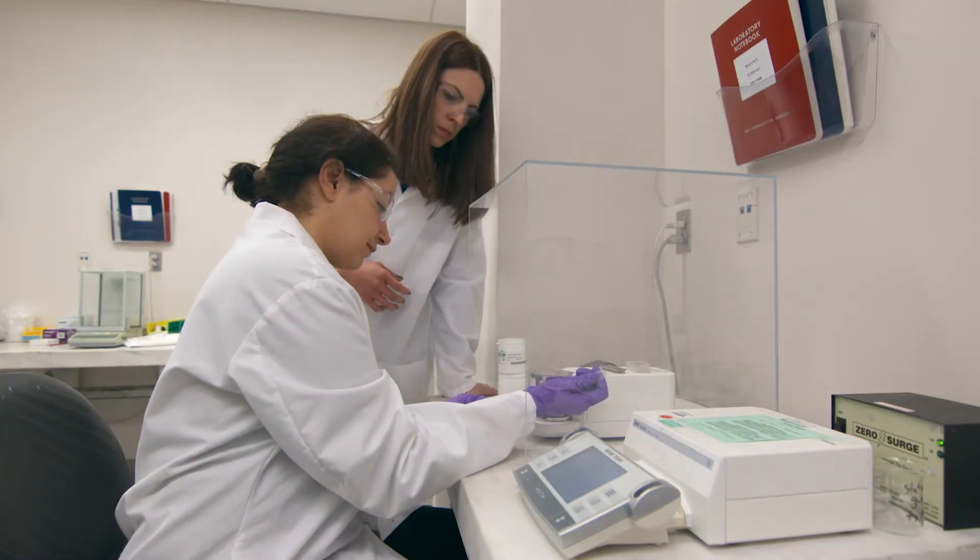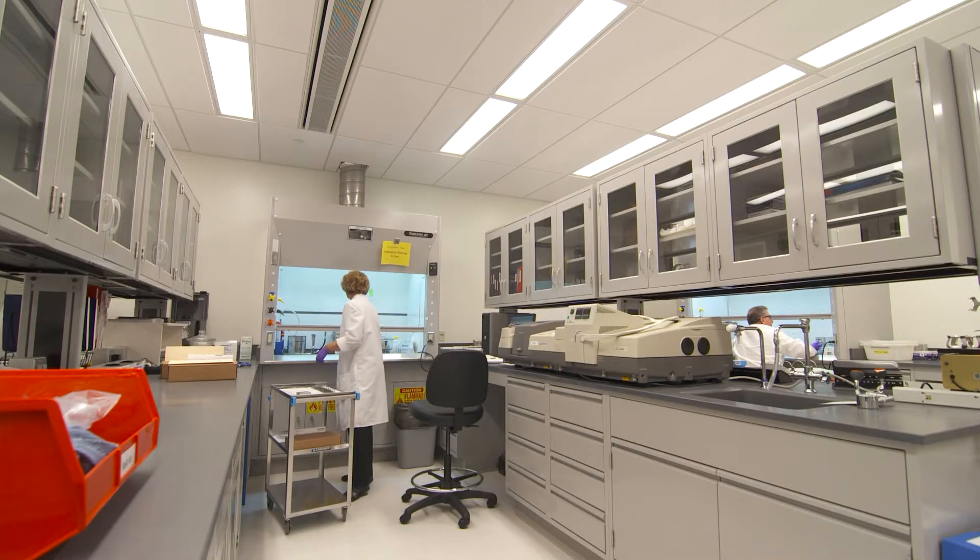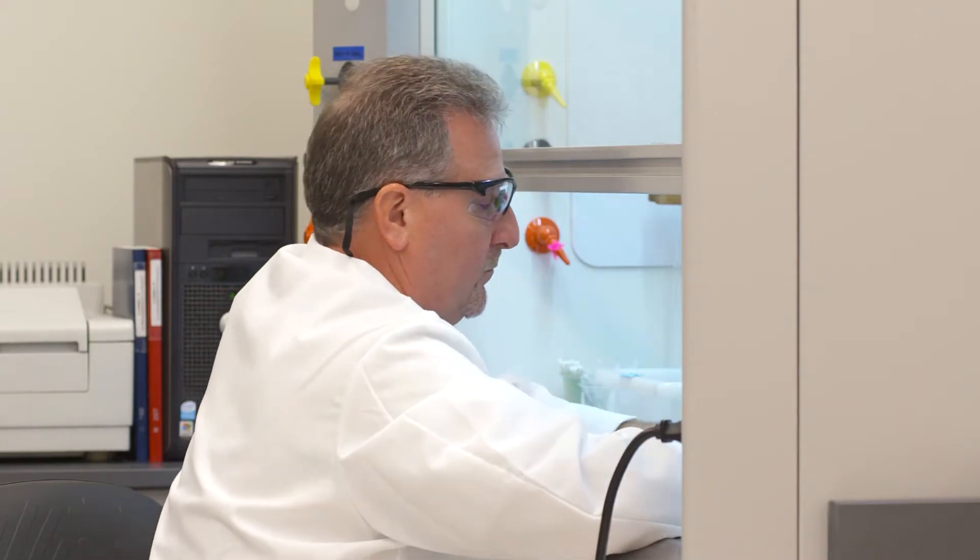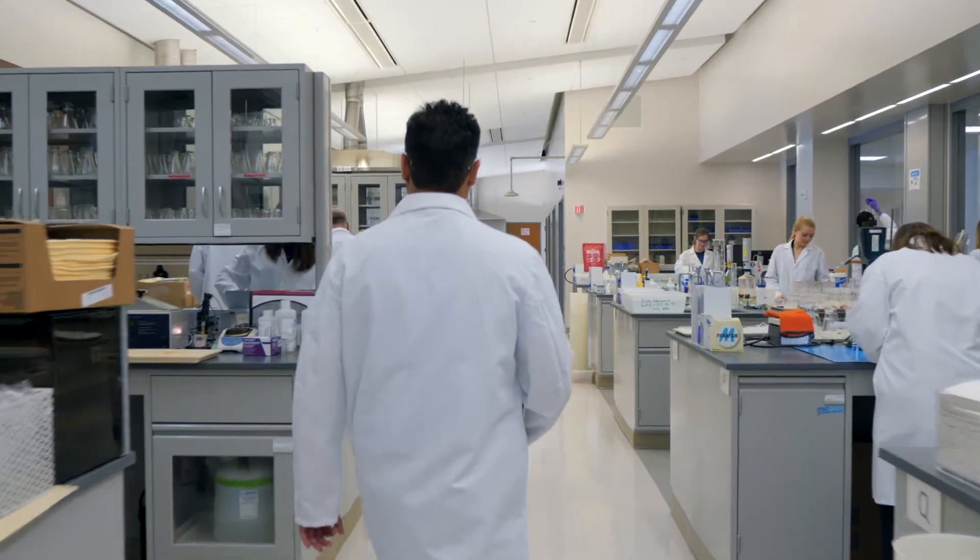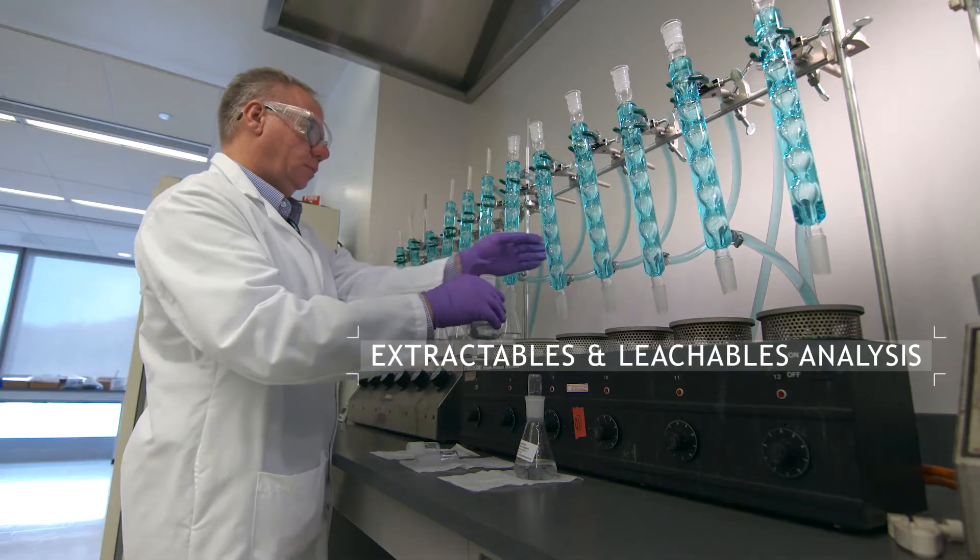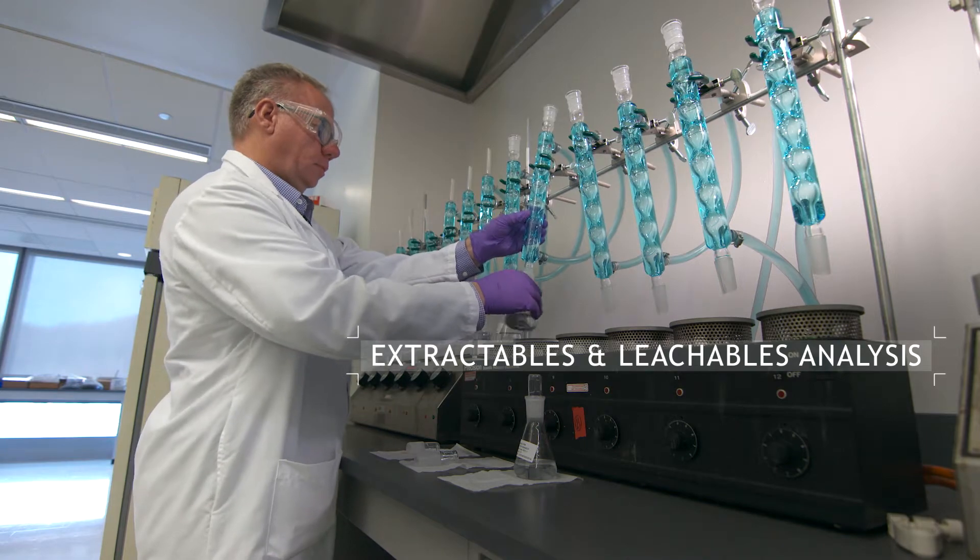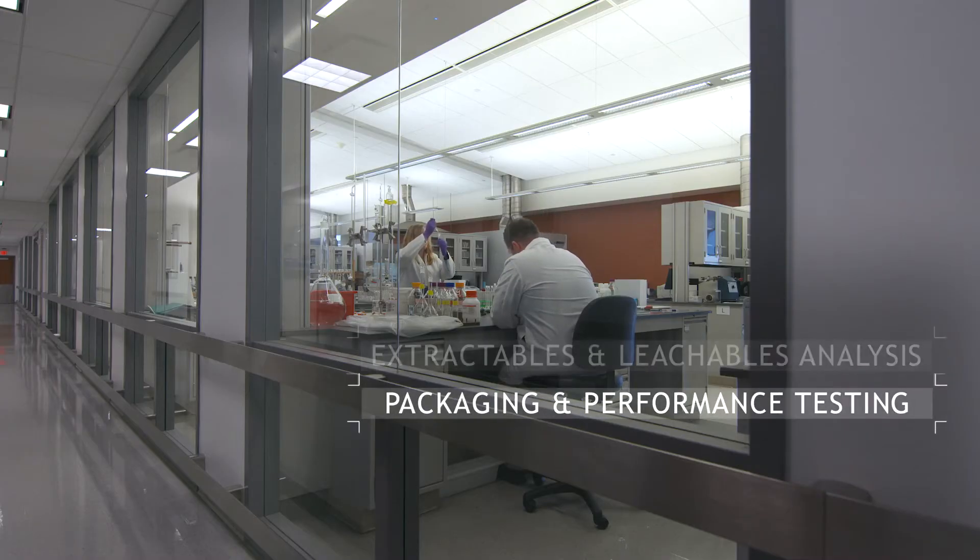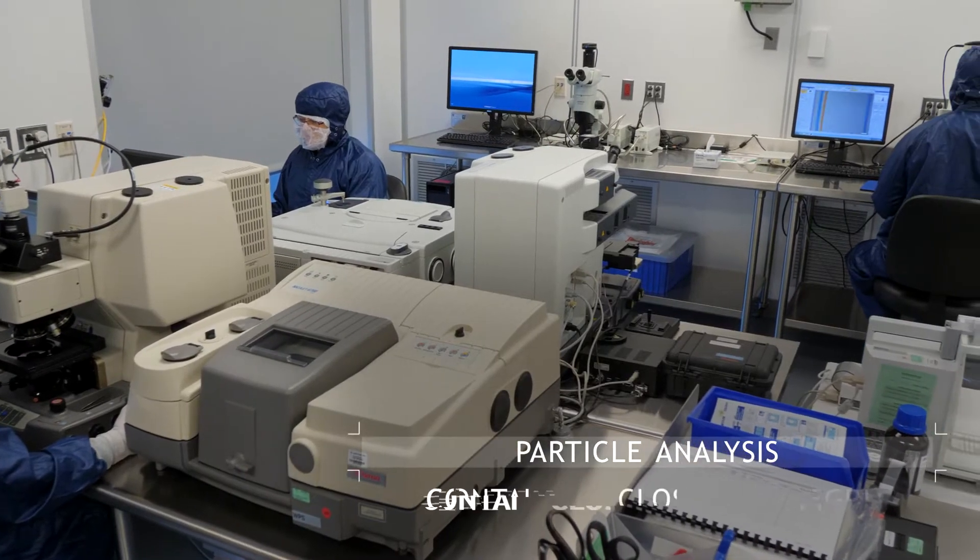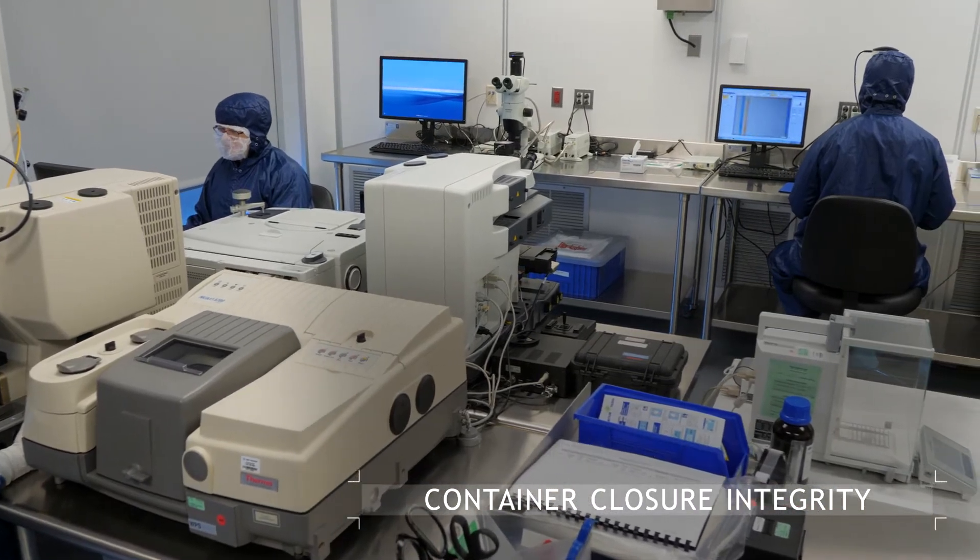A key member of the WEST technical team is the Analytical Services Organization. We provide specialized testing and services for drug packaging, devices, and combination products. Our scientific experts have vast experience in extractables and leachables, performance and packaging testing, particle analysis and container closure integrity, among other methodologies.